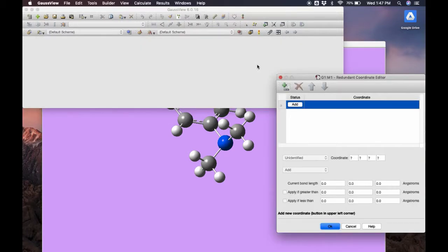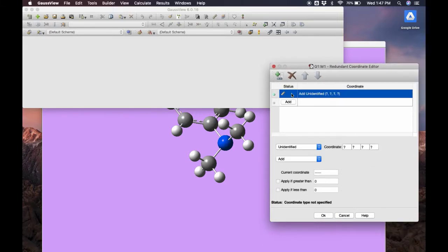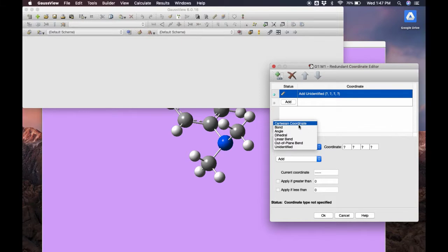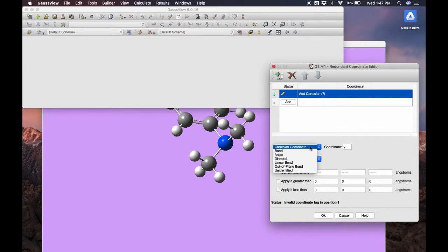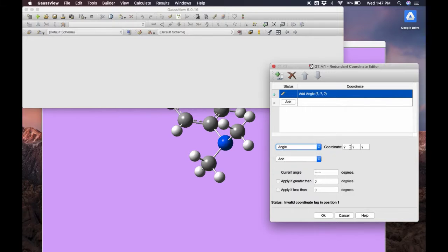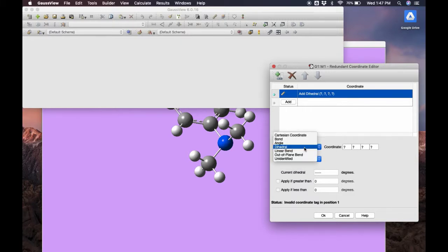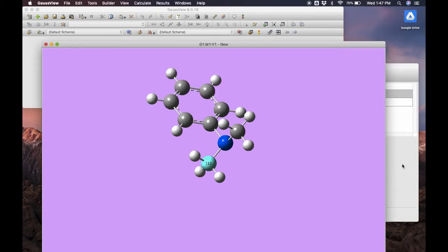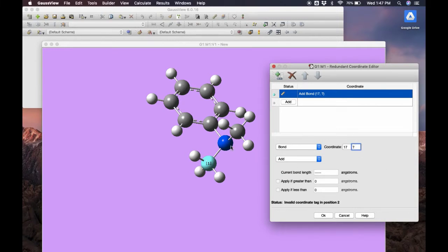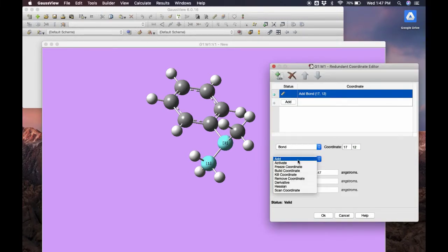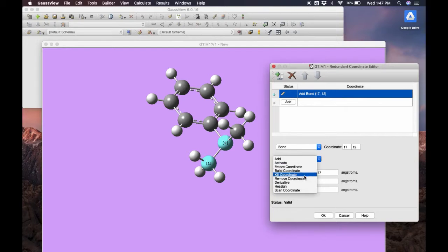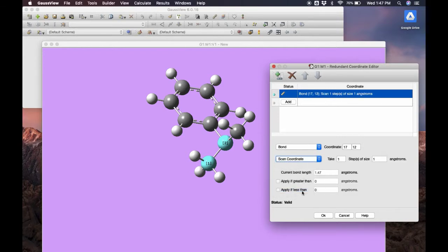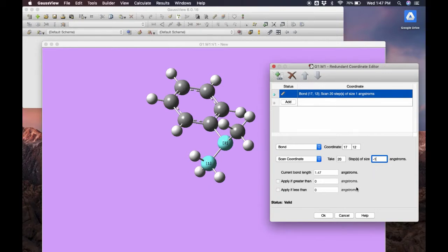I'll show you the redundant coordinate editor. We can add a redundant coordinate - either an atom, bond, angle, or dihedral. Let's select a bond. It's going to have two atoms, so we click on the two atoms in the bond that we want to analyze. Now the fields are filled. We can freeze the bond, calculate the Hessian, or scan it. For scanning, we specify steps and step length - here, 20 steps of one angstrom. If we wanted to decrease the bond, we'd make it a negative length.